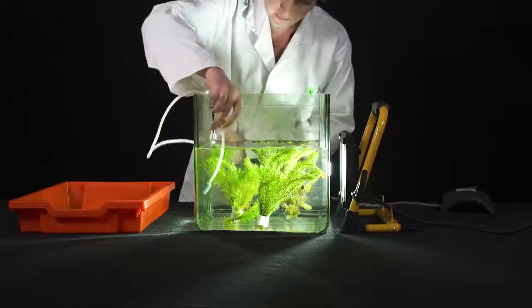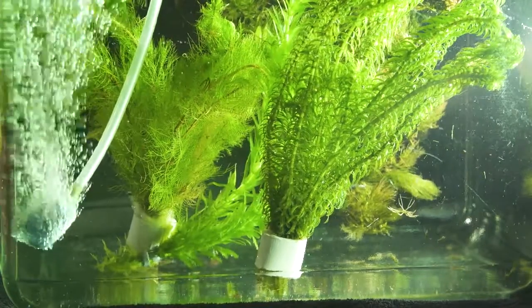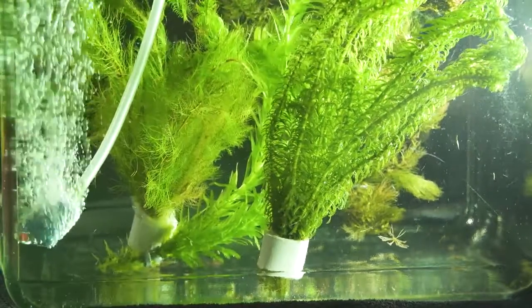The most important things when preparing for this practical are to find a reliable pondweed supplier that works for you in your particular location and at the time that you want to carry out the practical, and that you plan your purchase or collection. This may mean buying pondweed online or in person at a local pet store, aquaria or garden centre, or collecting it from a pond.